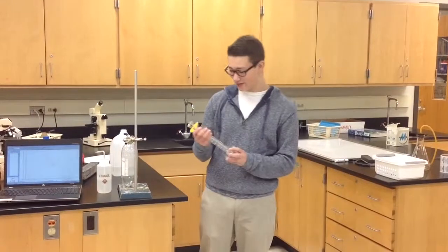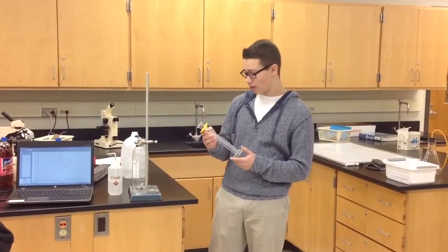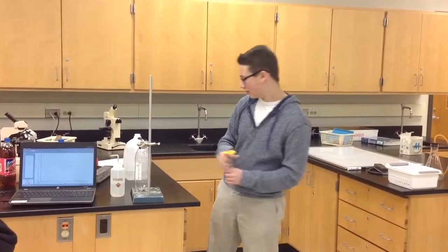Okay, so I have here a 100 milliliter graduated cylinder, and I will be pouring 400 milliliters, so 4 times, into the graduated cylinder, which I will then pour into the 1 liter bottle.